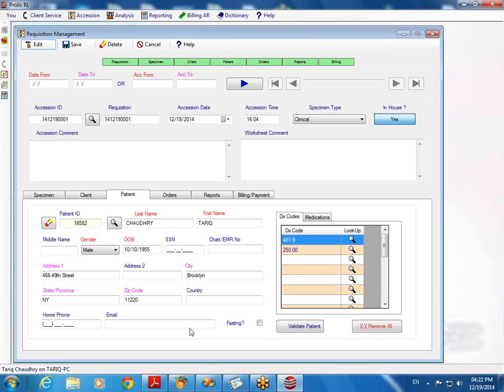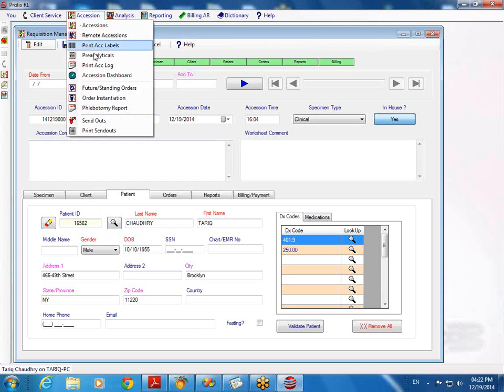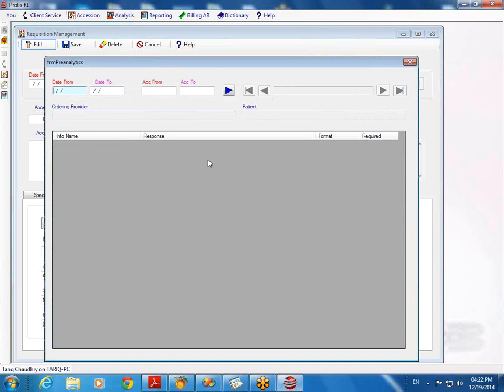Okay. So would we be able to call them pre-analyticals, like pre-analytics? Yeah. Let me show that to you. This is the pre-analytical screen. When you're accessioning inside the lab, after the accessioning, the user needs to put the clinical information right in here. And the system will display different fields for that information. However you have set up the tests, it will show up here, and you are going to enter the clinical information into the response field. Yes, and that would be able to appear in the report as well? Absolutely. Yeah.